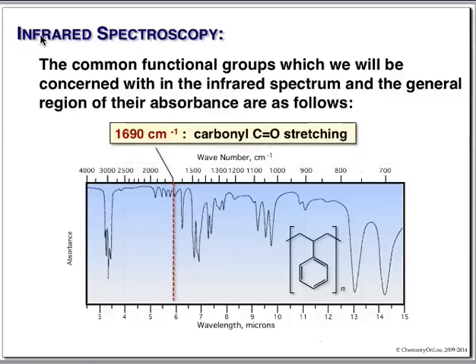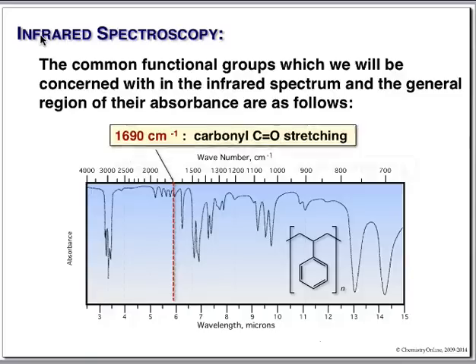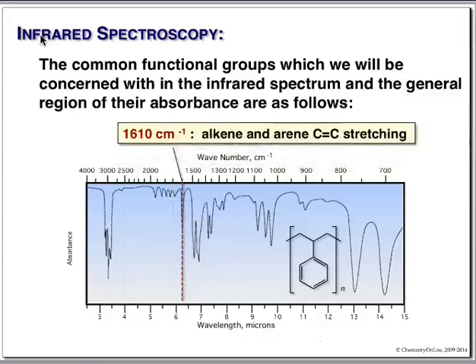Now these little guys up here we'll talk about in a bit, but these don't really count as peaks. 1600 and actually these guys in here too are consistent with the carbon-carbon stretching of a benzene ring. Typically, they'll occur as a bunch. Again, we'll talk about that in just a second.